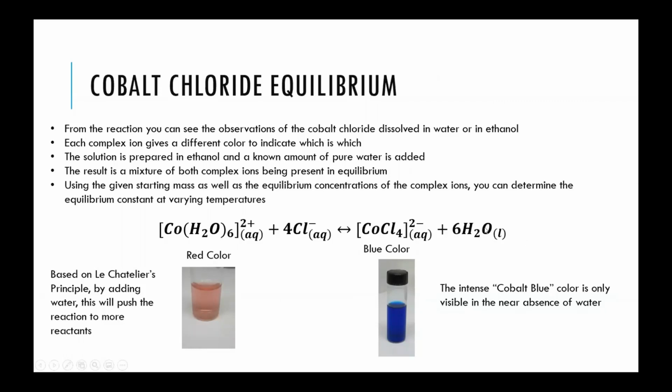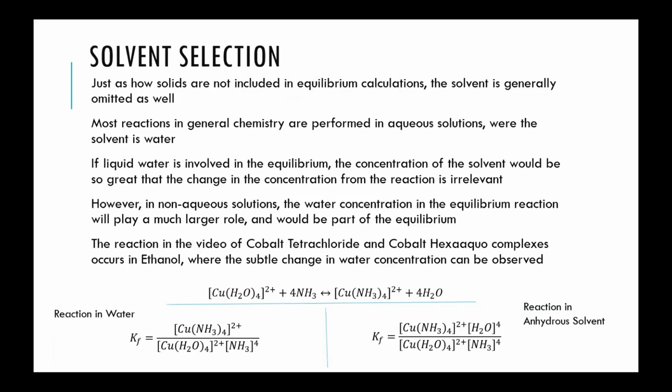When water itself is part of the reaction, it can be looked at in a couple of different ways. You're seeing how water reacts and the equilibrium between the red component and the blue component. And this is where solvent selection can be very, very important. Solids can dissolve not only in water, but in other solvents as well.